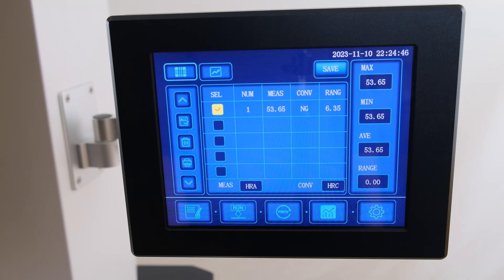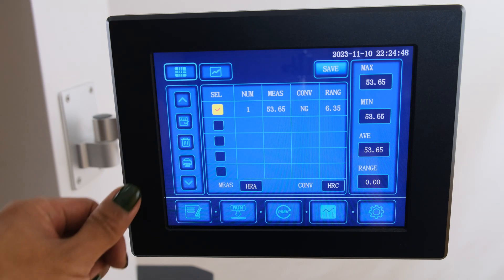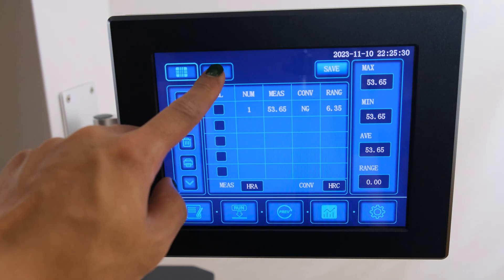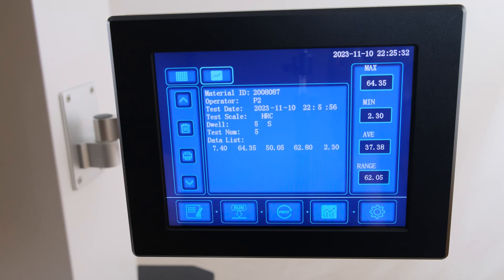Additionally, data points can be output via printer from this menu. Any batches can be manually reviewed by selecting the secondary submenu under this menu.